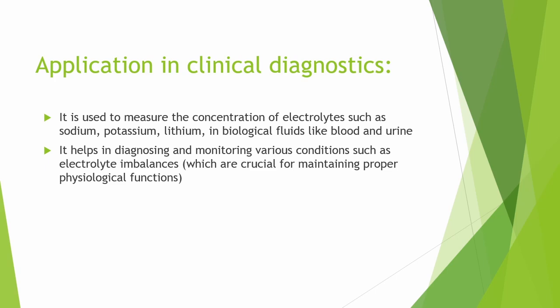When it comes to the application in clinical diagnosis, it can be mainly used to measure the concentration of electrolytes such as sodium, potassium, lithium in biological fluids like blood and urine. It also helps in diagnosing and monitoring various conditions such as electrolyte imbalance, which are crucial for maintaining proper physiological functions.